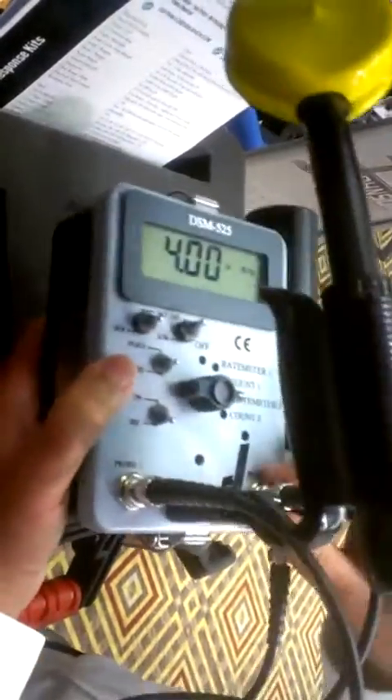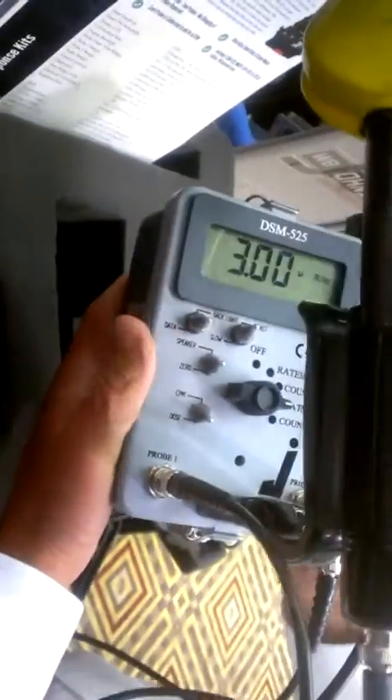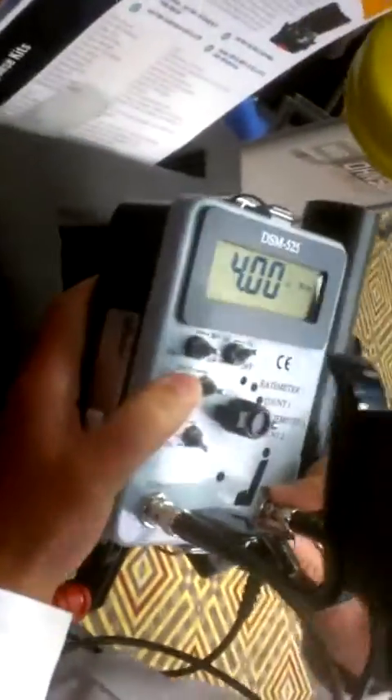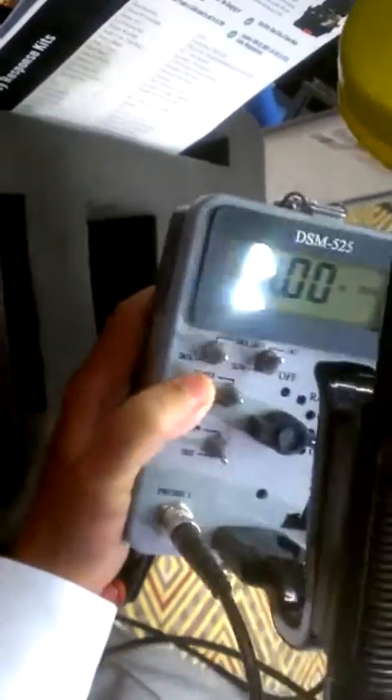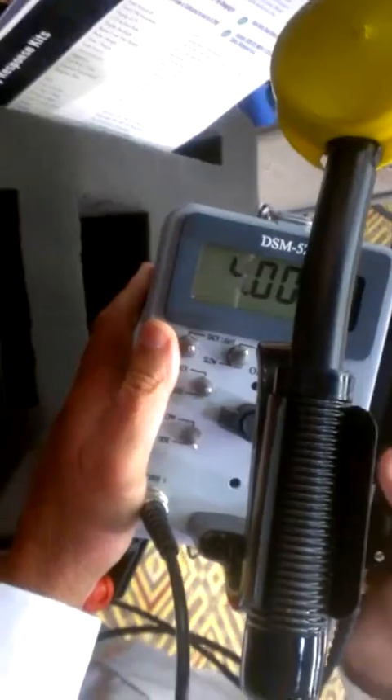What's unique about this instrument too is both detectors are hooked up live, so you never have to shut off, never have to unhook. Two modes for each detector actually gives you four modes of operation.